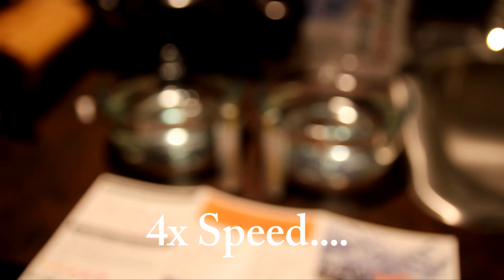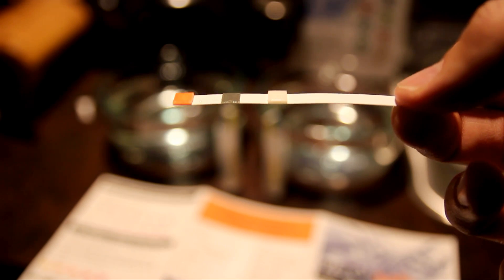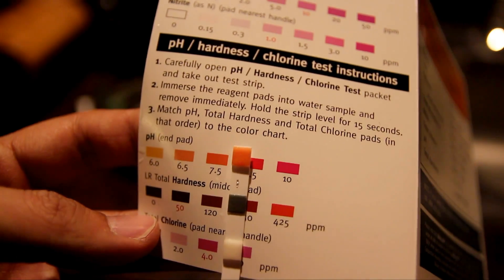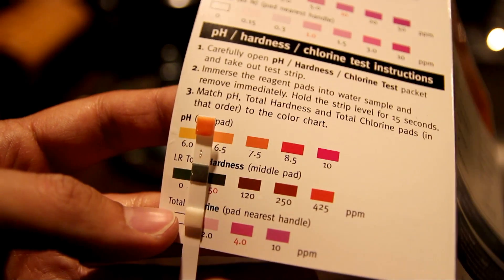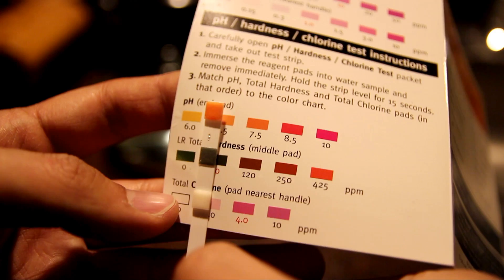Now let's test the reverse osmosis water. After 15 seconds, the pH is again 7.5. The hardness is close to between zero and 50, which is much lower than the city water. And again, chlorine is zero.